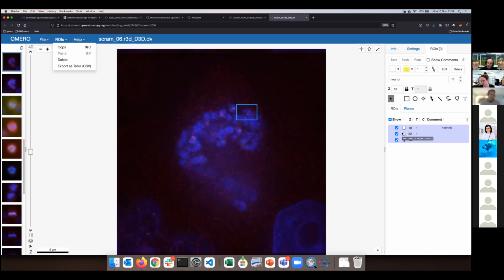One object is called image. It's just a Hibernate object, and then from there is a link to another object which is called ROI. But these are very lightweight things, and the heavyweight image is sitting nicely there on the bottom and is only being referred to, so that we don't lose it, but not changed, not rewritten, not added to, not anything.